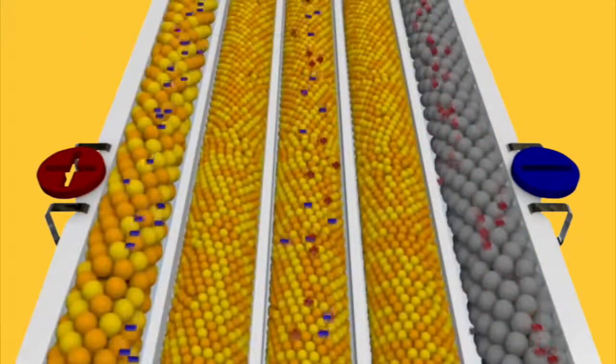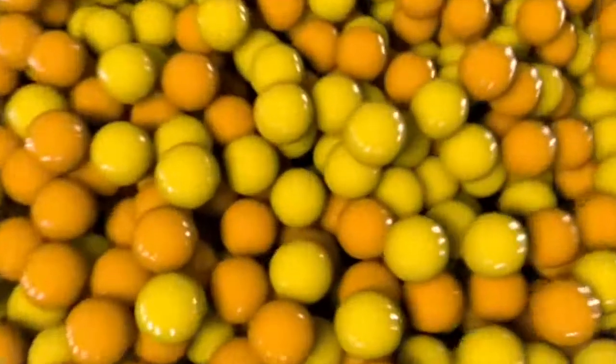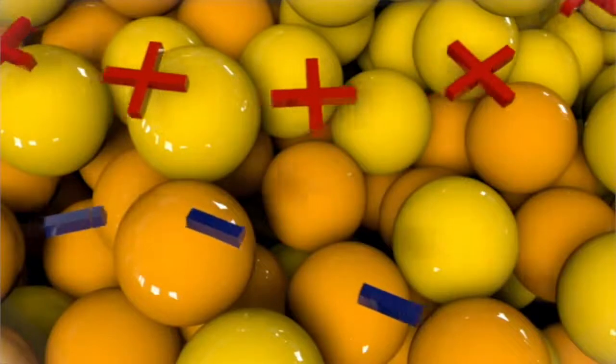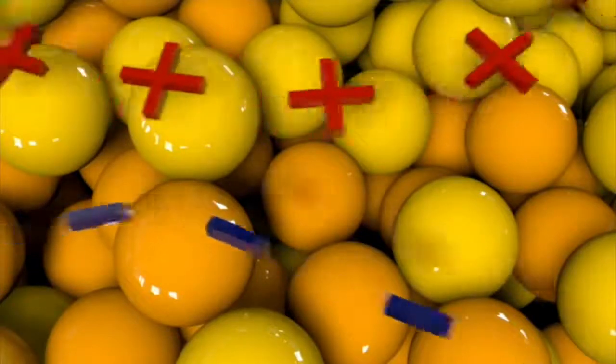By including an ion exchange media between the two membranes, kinetic of ions transportation is greatly enhanced. This facilitates the purification process and decreases the electrical consumption.